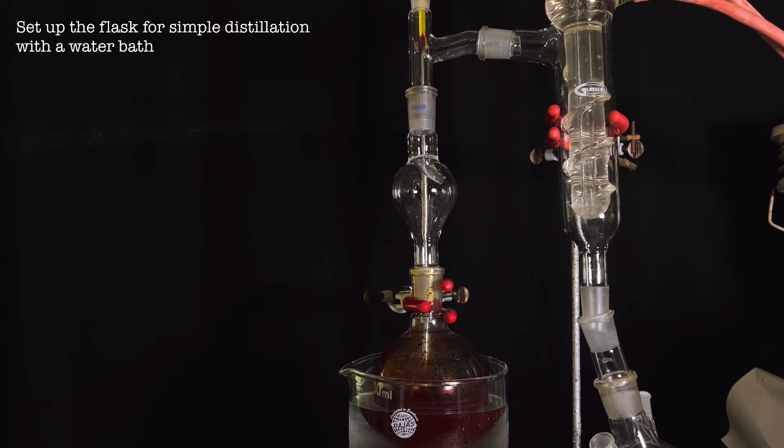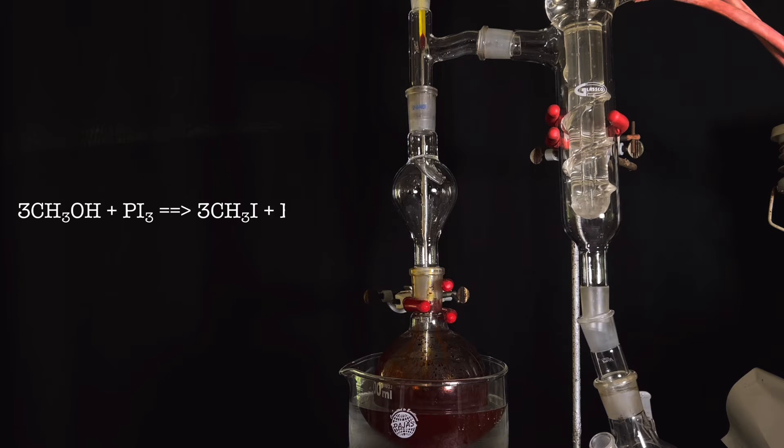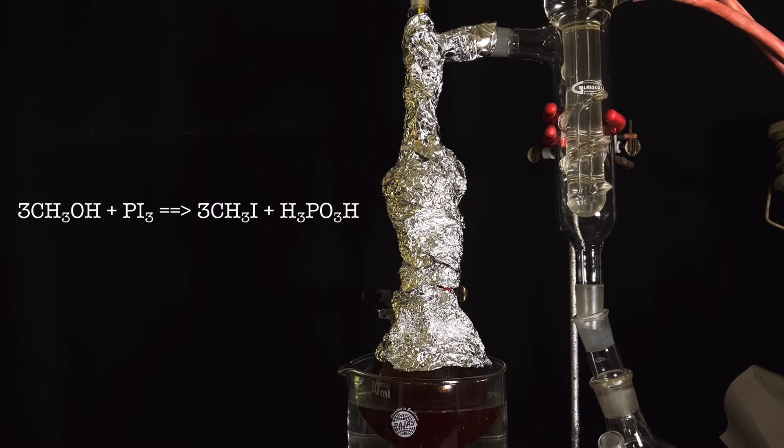Now let us discuss the reaction. The iodine initially reacts with the red phosphorus to form phosphorus triiodide in situ. This in turn reacts with the methanol to form the methyl iodide.